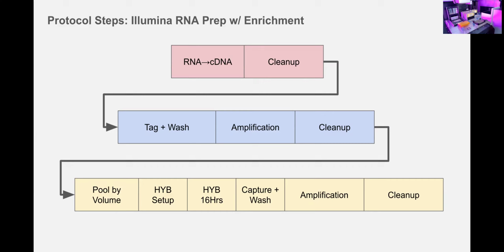We have 3 different beads being used in this protocol. We have the tagmentation beads, we have the regular cleanup beads, and at the end, during the capture washes, we have the streptavidin beads. So all these different steps have different requirements that had to be finessed and fine-tuned. And also the scale changes.